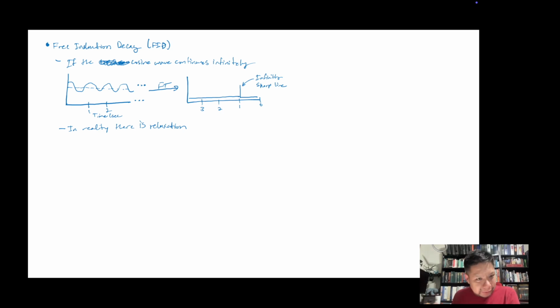So what does a cosine wave look like for something that has relaxation in it? Well, it looks like a cone, actually. And in this manner, we have what we would refer to as exponential decay. And so when you're doing an NMR on the computer screen, you'll see this thing that's an exponential decay, also known as a free induction decay, or a FID.